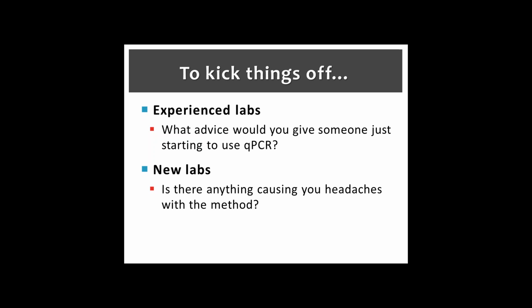So questions? I'm new to the qPCR also, and it seemed like when we got a lot of material, the method itself seems cut and dry, but it's all the prep work to get to running the method that I'm having major issues with. Setting up my solutions and making sure I have the right solutions and just that initial setup. Well, this is in chapter 4, and so it's just kind of trying to piece everything together to just get started.